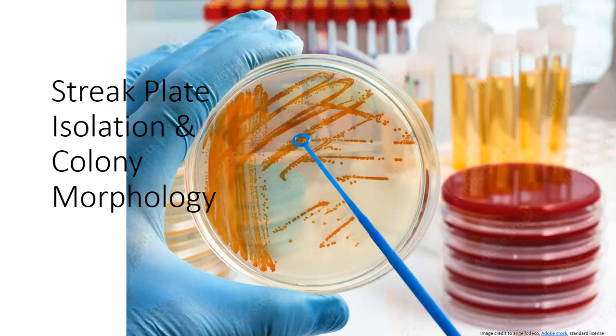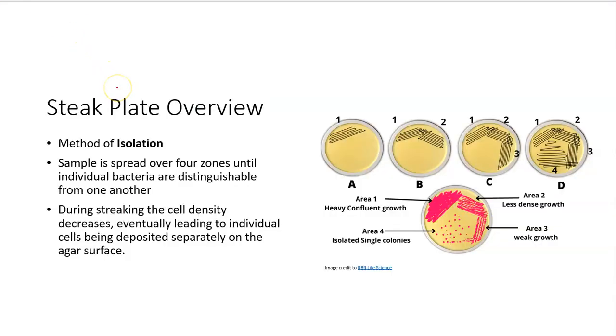In this lesson, we'll be discussing the streak plate isolation technique that's commonly used in microbiology labs and colony morphology. The streak plate technique is a method of isolation.